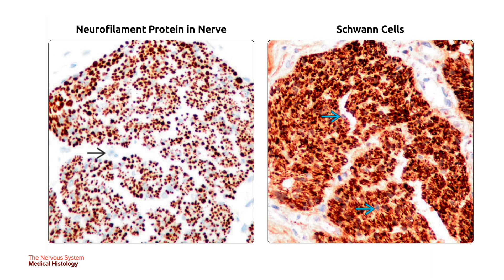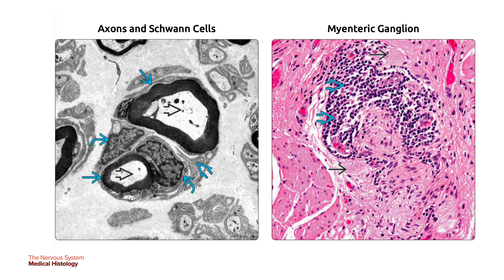On the left is a medium-power neurofilament protein stain showing a cross-section of your peripheral nerve with strongly positive fascicles of nerve fibers. The spaces in the single black arrow between the fascicles represent the perineurium. On the right, S100 protein stain shows Schwann cells staining strongly positive in the endoneurium, while the surrounding fibers in the single blue arrow are negative.